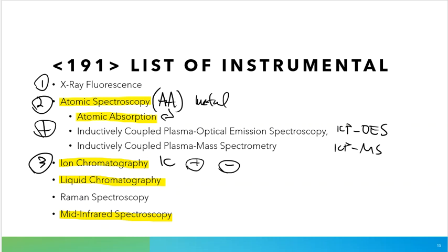So if it's something like sodium, let's say that I've got sodium that I want to analyze, folks. So there is a chemical ID test for sodium. It's a couple of reagents. I add it in. I see what's there. I see what's not. I write down the observations. Is a precipitate formed? Those are the types of things that the chemical version of the ID test is going to do. If I didn't want to do the chemical ID test, though, I could use an AA or I could use an ICP system, because those are built to measure positive pieces.